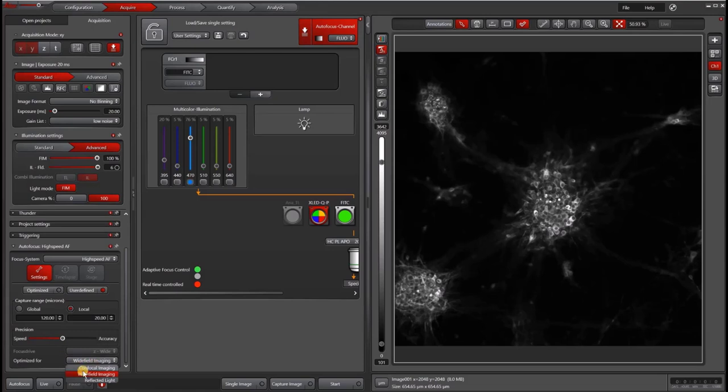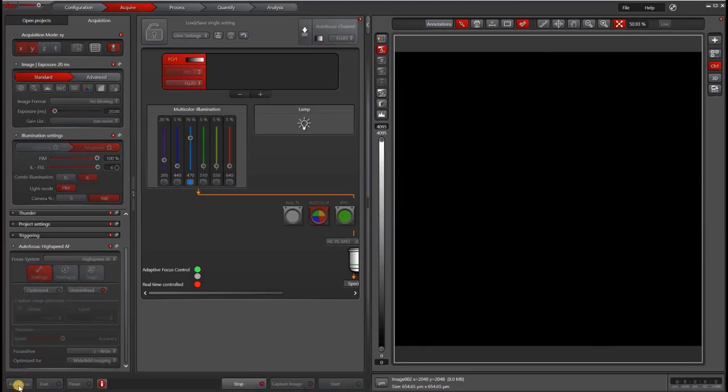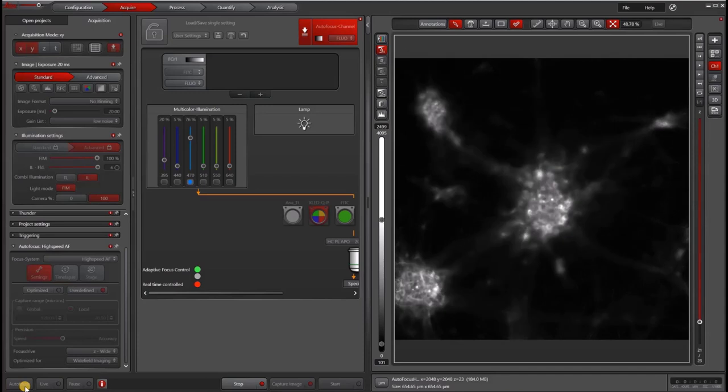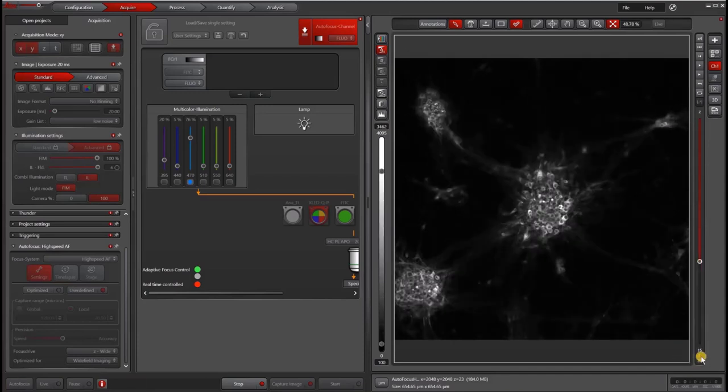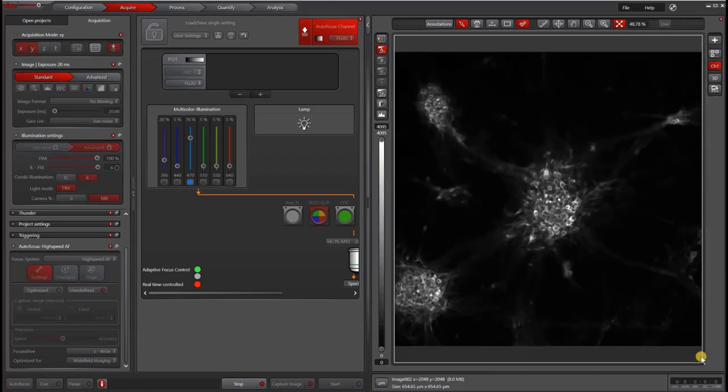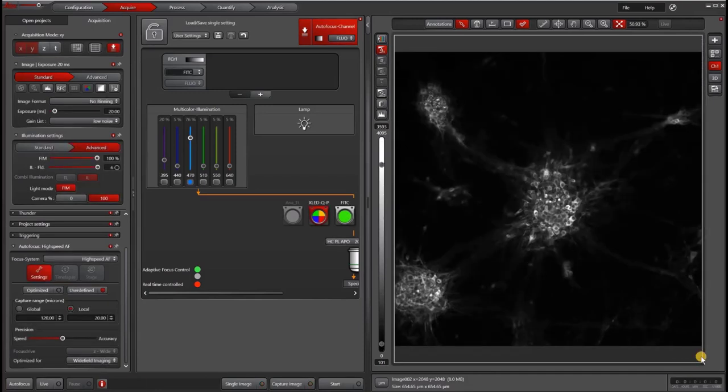You do want to choose wide field imaging for your optimization. To test your settings, go ahead and click the autofocus button in the bottom left-hand corner. It will run a quick Z stack. You can see it came up with 23 and the image that it ended up choosing was in focus.